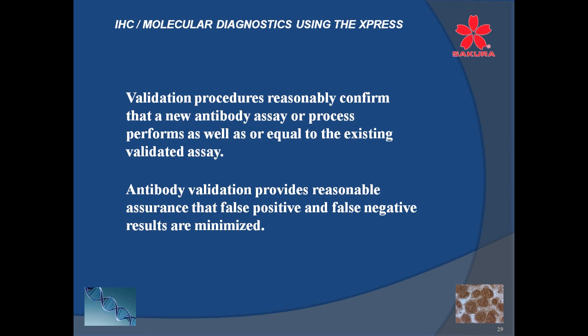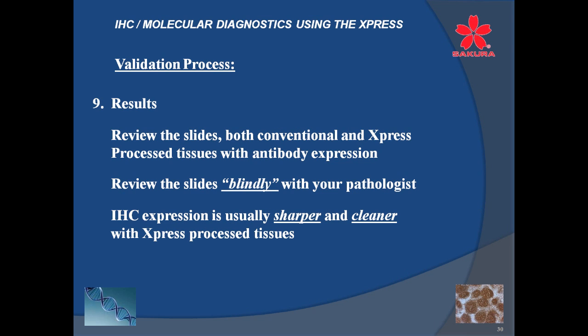But once you've completed, you'll need to see if you're getting equal staining or better with one processor or another, then you'll know which one to stay with. Hopefully, I think you'll see the results with rapid processing to be very, very good, comparable, and even in most cases well above the quality of what you're getting with conventional processes. We'll see why in just a moment. Antibody validation provides reasonable assurance that false positive and false negative results are minimized as much as possible.